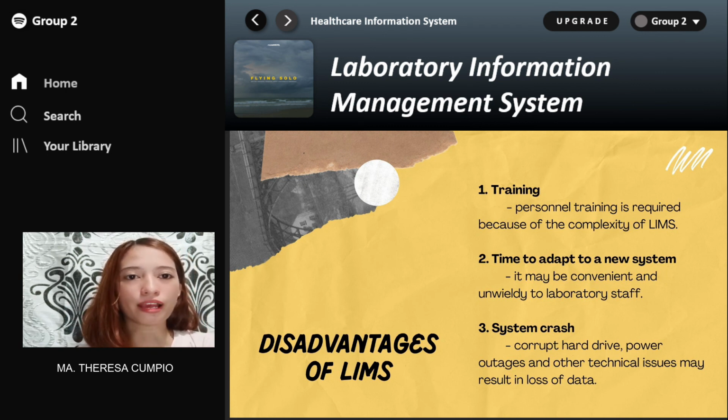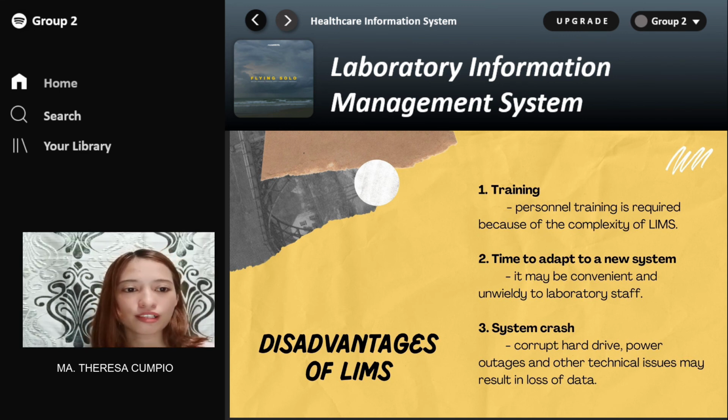The second one is time to adapt to a new system. LIMS projects should engage all the stakeholders early and encourage their input through open communication. Take time to understand your needs and create a clear requirement specification, including the nuances and needs of the different laboratories and sites. This small overhead will pay dividends over time with a more user-friendly system, higher productivity, and happier staff.